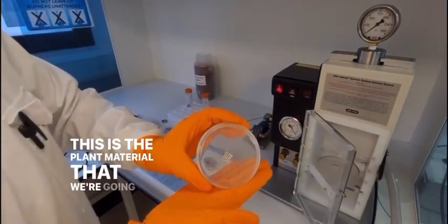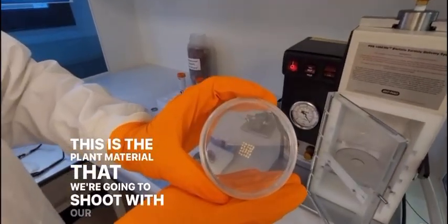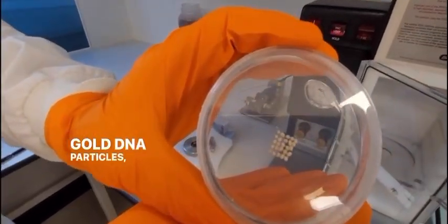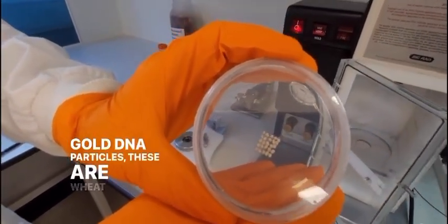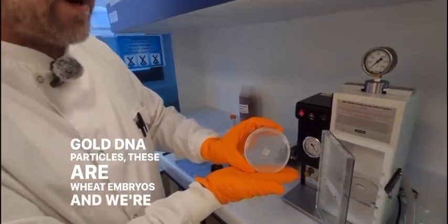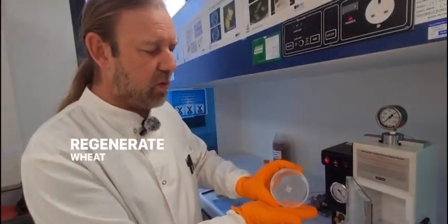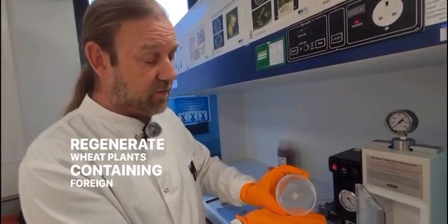This is the plant material that we're going to shoot with our gold DNA particles. These are wheat embryos and we're able to regenerate wheat plants containing foreign DNA.